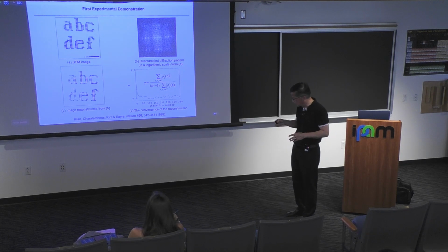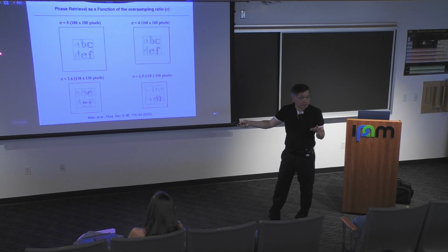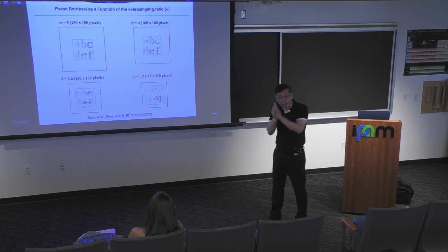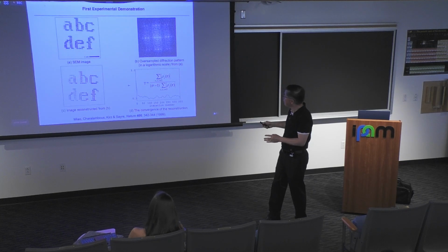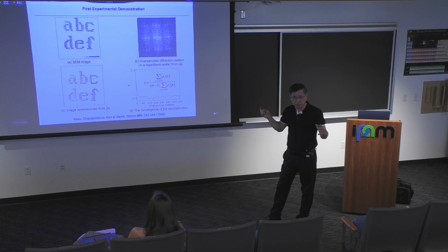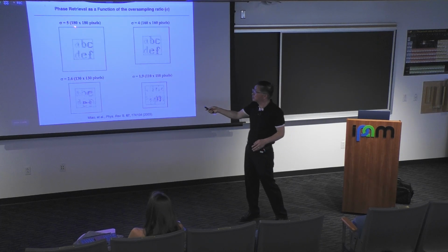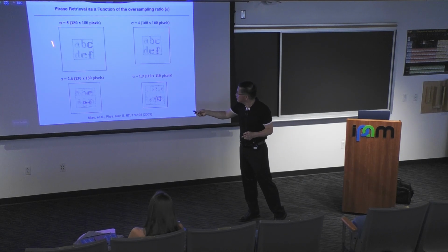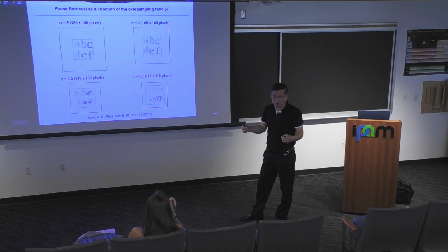If any question, raise your hand. Okay, and then I also did it for this same diffraction intensity. I downsampled it. This is oversampled quite large, actually more than maybe 20. I downsampled the diffraction pattern to equal to 5, which means the largest square area divided by the small square area is 5.